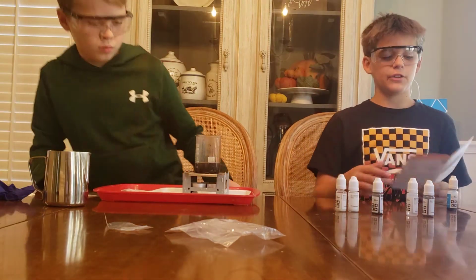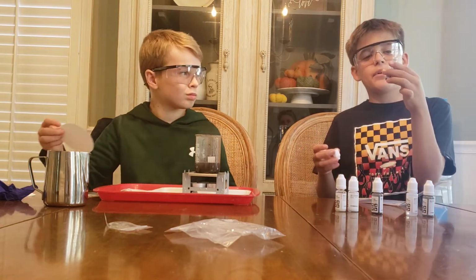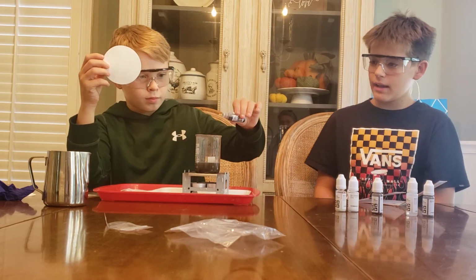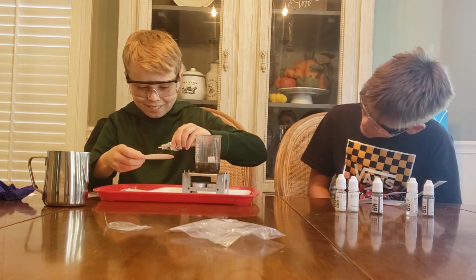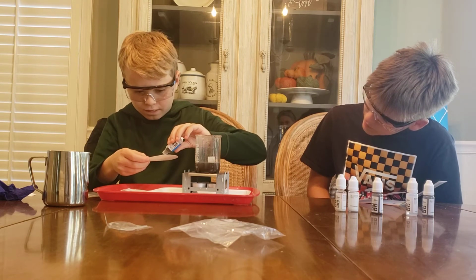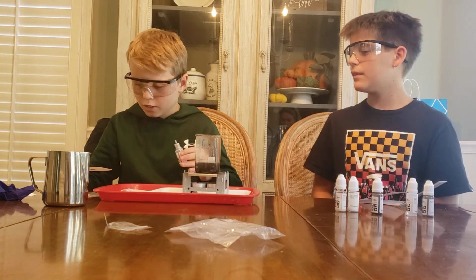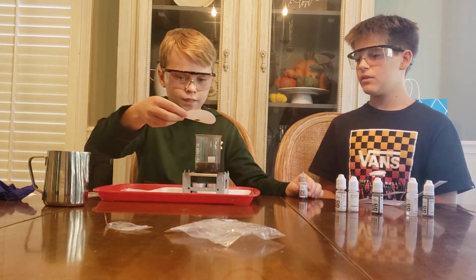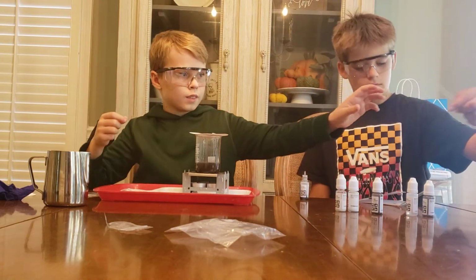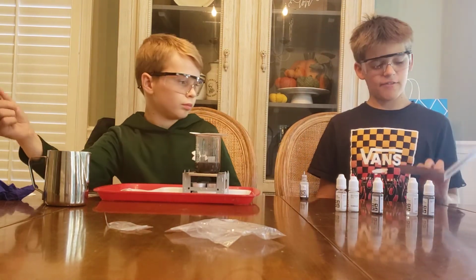And we're going to put a new filter paper on, but this time we're going to put 1 drop of thymol blue. No, wait, on the paper. Oh, yeah. 1 drop. There. Now put the thymol blue on top. And wait 10 to 15 minutes.